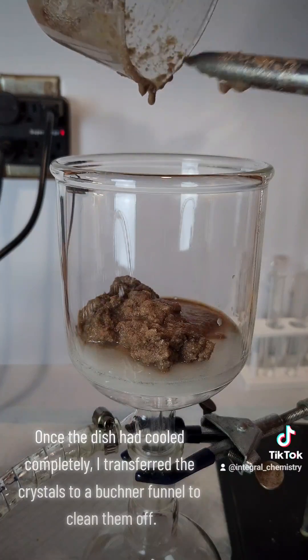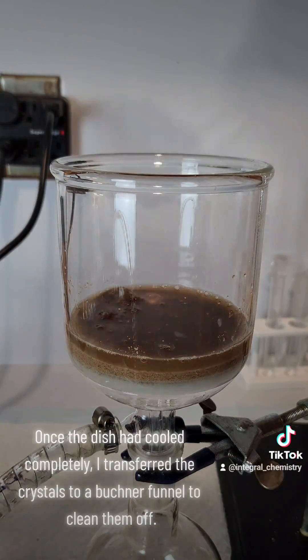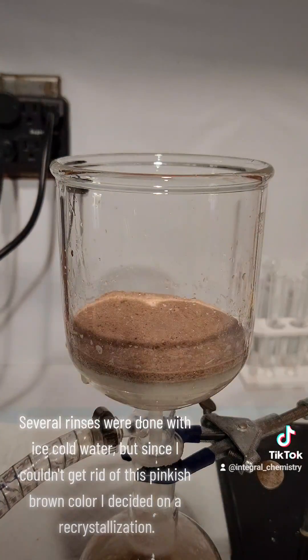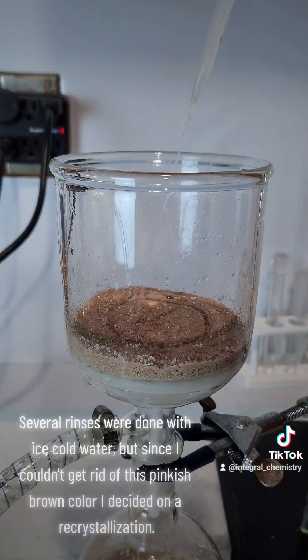Once the dish had cooled completely, I transferred the crystals to a Buchner funnel to clean them off. Several rinses were done with ice-cold water, but since I couldn't get rid of this pinkish-brown color, I decided on a recrystallization.